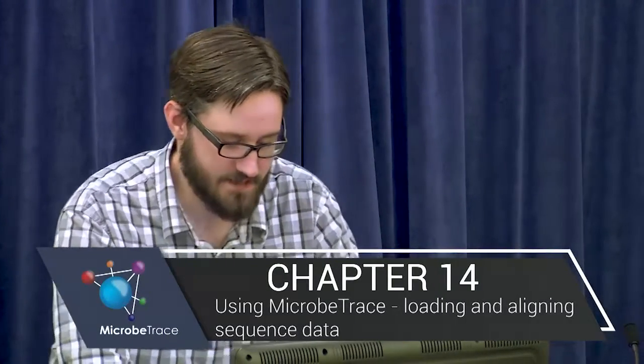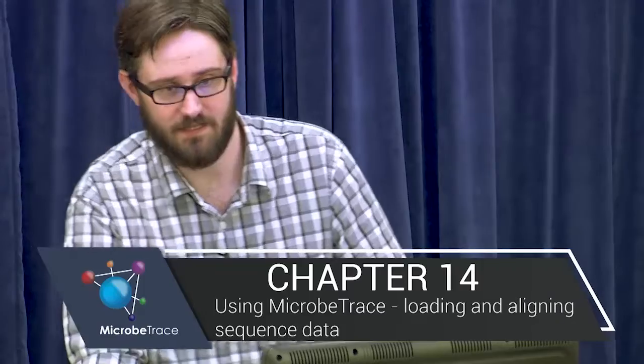Okay, so we're going to continue using MicrobeTrace to visualize sequence data. In the past, in the other videos, we've shown visualizing contact network and demographic data. This time we're going to focus specifically on the sequence data that arise from these types of investigations.